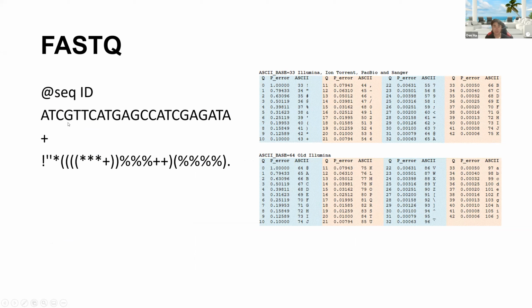And this is the FASTQ file. The FASTQ is the file you get once you get your sequencing done. So it comprised of these 4 lines of structures, multiple lines of these 4 lines, right?